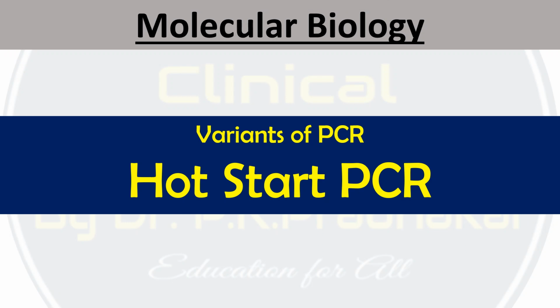The literal meaning of Hotstart PCR is that it is a modified form of conventional polymerase chain reaction, or PCR, which reduces the presence of undesired products, the unwanted extension of the DNA. All the undesired, unwanted PCR amplified products are going to be reduced by this method. Not only that, primer dimers or non-specific DNA amplification at room temperature are also going to be reduced. Later on we will see detail about that.